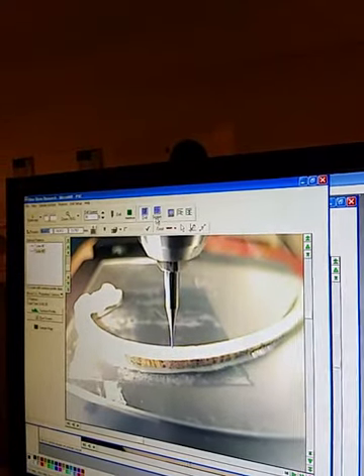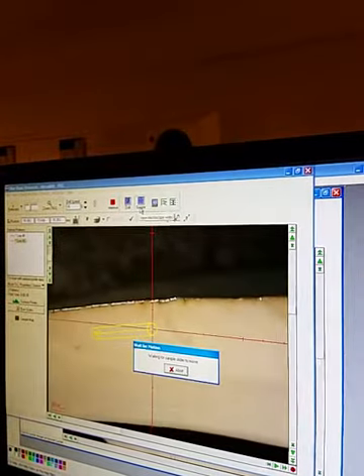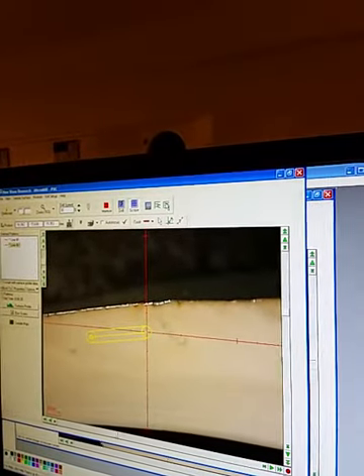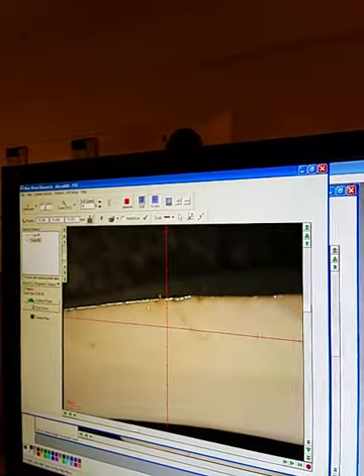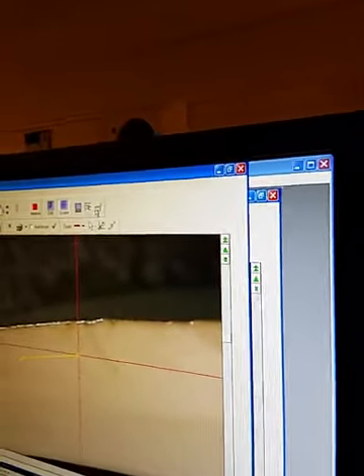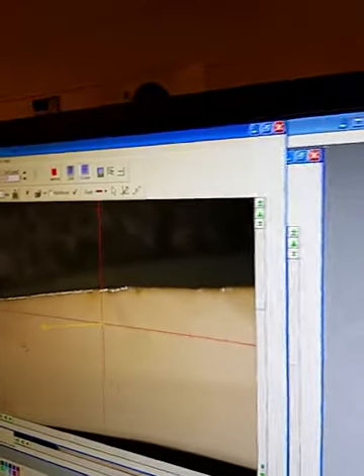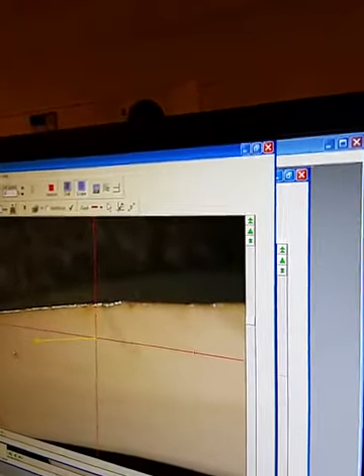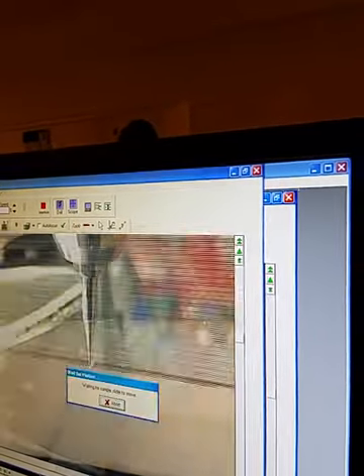Okay, and then we go back to the scope and see if there's some little contact points. Yeah, look, see like right there? That looks like, yep. Can't really see that one, but if that one's on, then I think it's a good one. What about that? I don't know what that is. That looks a little odd, doesn't it? Was that there before? I don't remember if it was. I guess we'll find out in a second. Yeah. So let's run the scan.